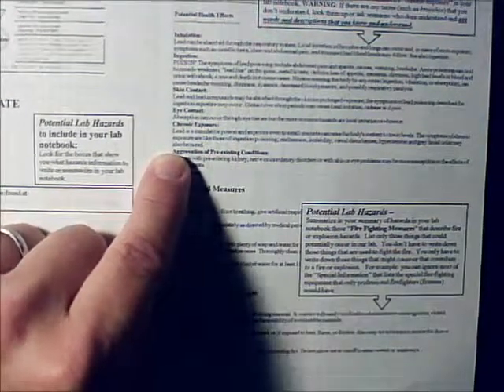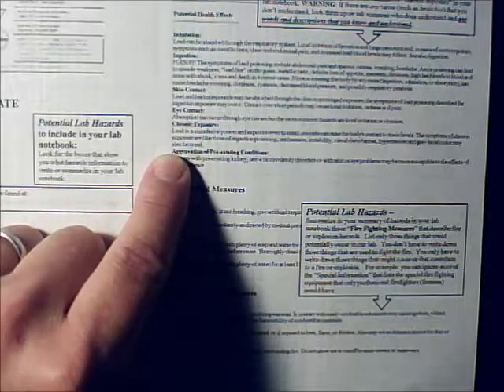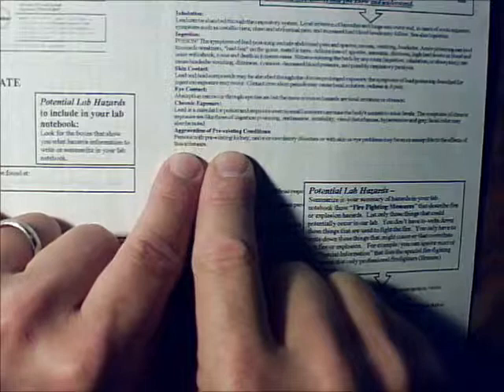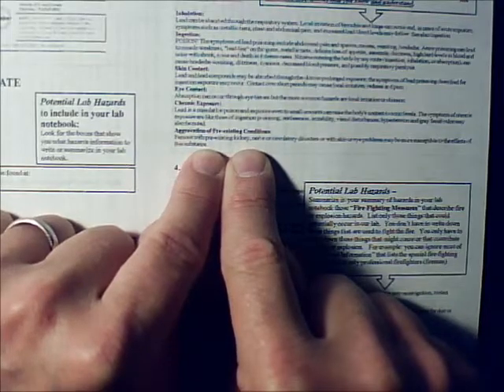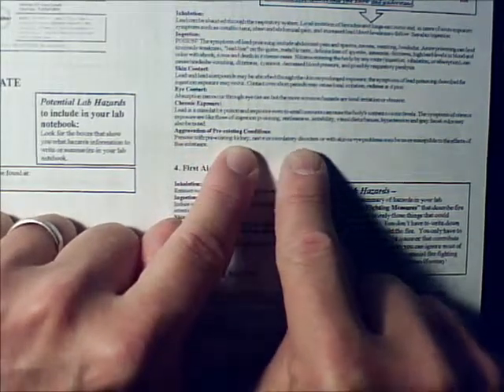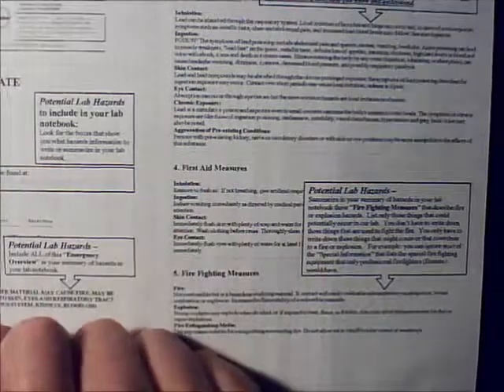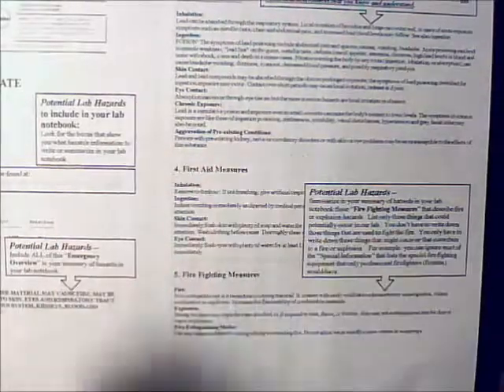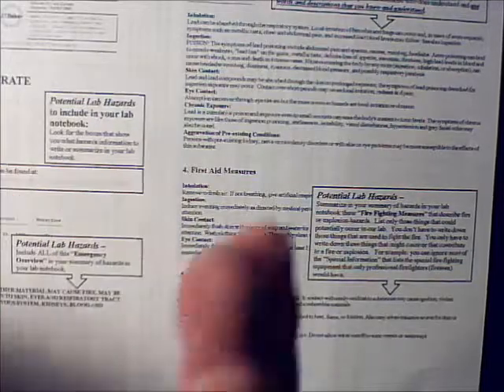Not unless you're handling lead compounds all the time. If you know you're handling lead compounds all the time, you should have chronic exposure listed as a hazard. How many of you are working with lead compounds? I don't see any hands going up. Because you shouldn't be. Pre-existing conditions. Does anybody have a kidney condition? Don't raise your hand because I don't want everybody to know. But if you have a kidney condition or nerve or circulatory disorder, you need to write down these pre-existing conditions being aggravated. But if that doesn't apply to you, and I should have that information, you should have already given me that information. I should know if you have a pre-existing kidney condition because that's important for your safety.